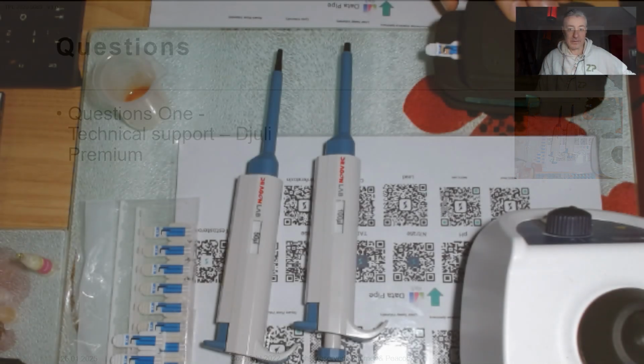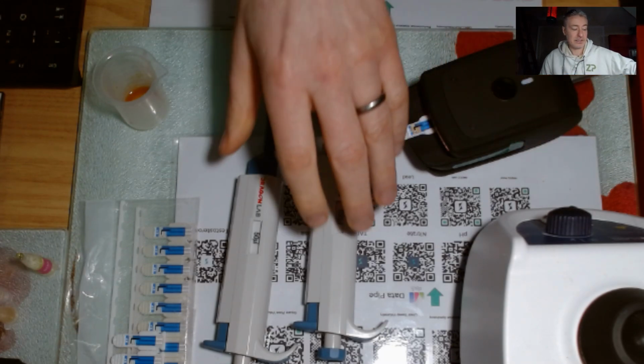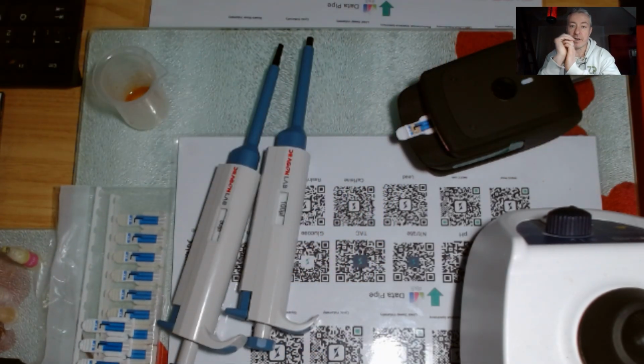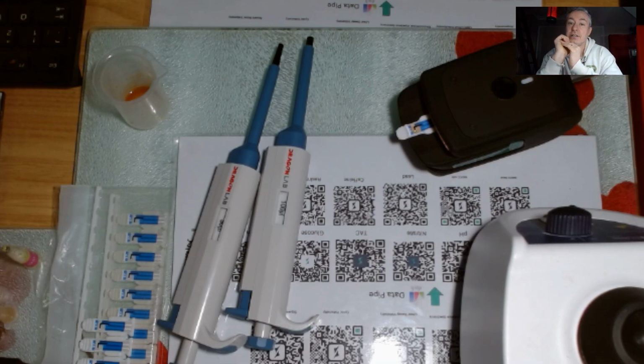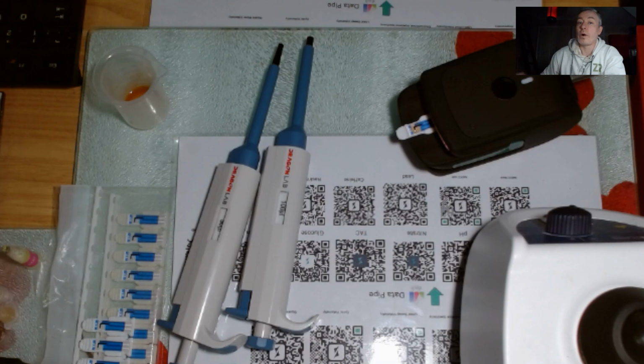and I think some of the people who will watch this webinar will have a FoodSense Generation 4, just know that there is a system called Djuli. So every time you do a measurement, all your data goes up to Djuli. Now you'll see Djuli in action in a minute, but just understand that it's really important that we identify who you are, because the email associated with your login, we need to make a premium account, because then all your data will get saved, and it also means that ZP can help with troubleshooting quite a lot.